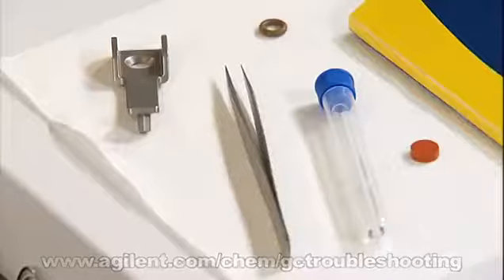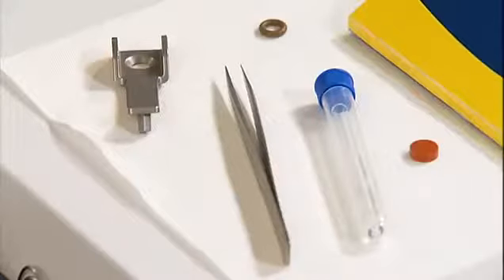Some companies replace these on a daily or weekly basis depending on the number of samples they run. You'll need the wrench that came with your GC, tweezers, and the replacement consumables.